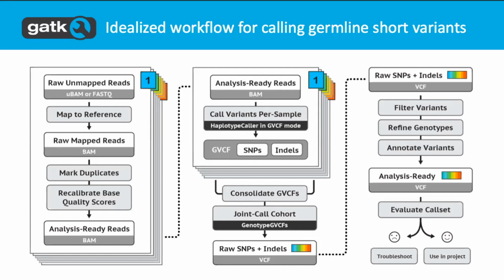That is the other data types. Thank you so much for mentioning that. Because for a very long time, GATK has been very specifically developed for Illumina short read data. Although there was a poster like 5 years ago about adapting the pipeline for PacBio. A lot of water under the bridge since then.